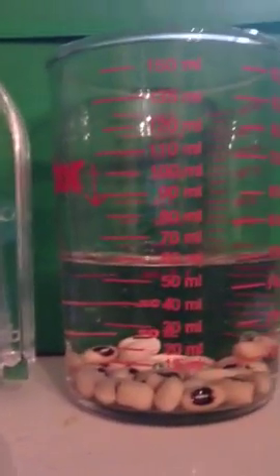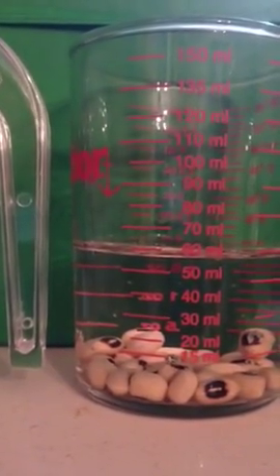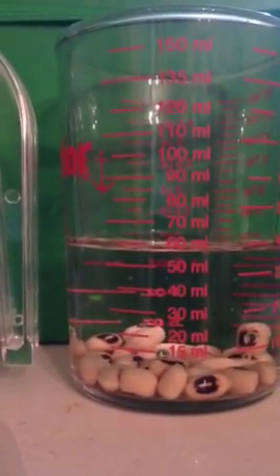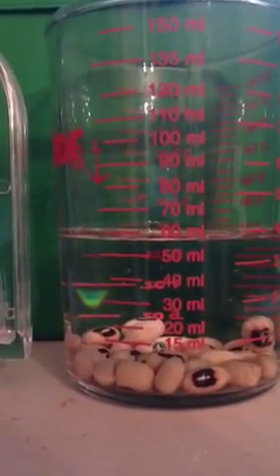Now, because these are in increments of 10, we can estimate to the nearest ones place. So I'm going to say it looks like about 58 milliliters. That's what I'm going to write down as my final volume. So the volume rose from 50 to 58 milliliters, meaning these black-eyed peas have a volume of 8 milliliters.